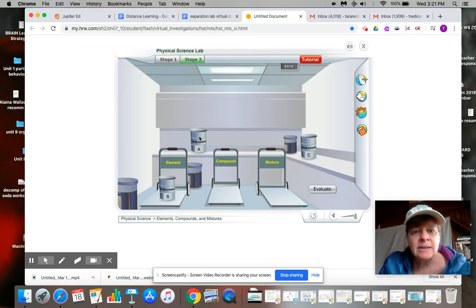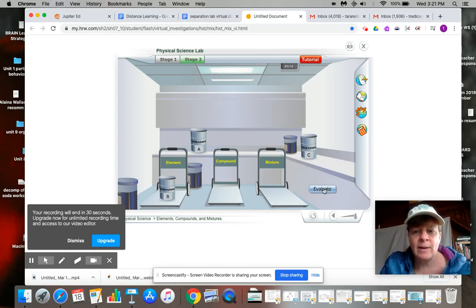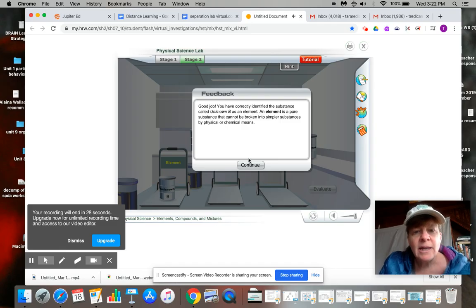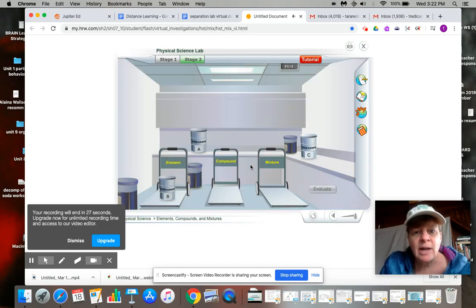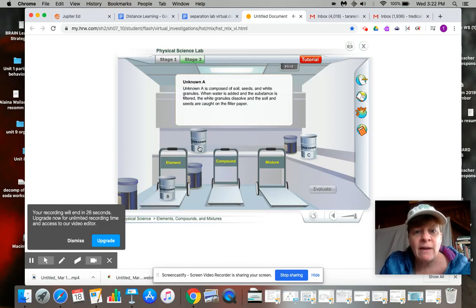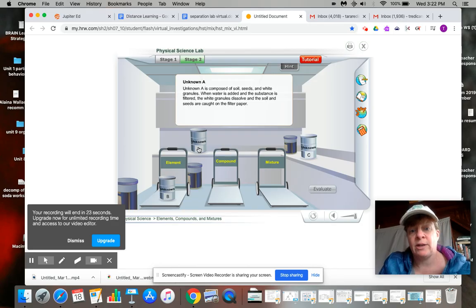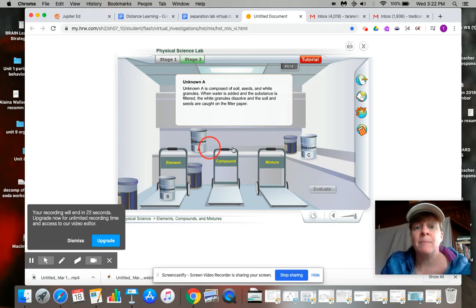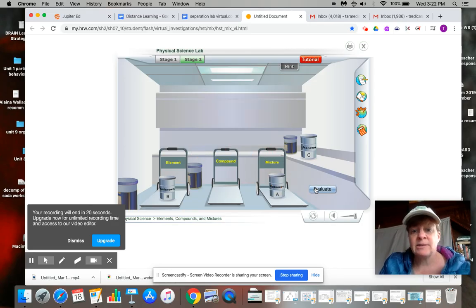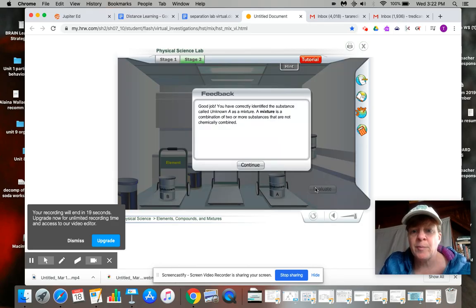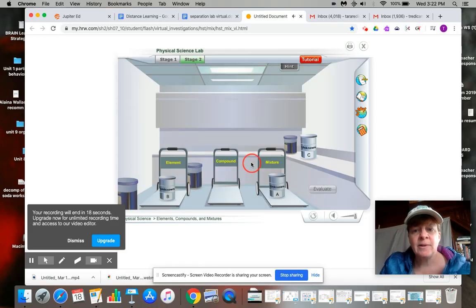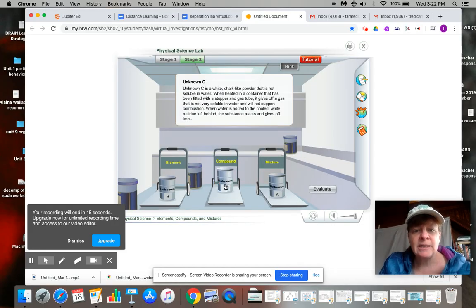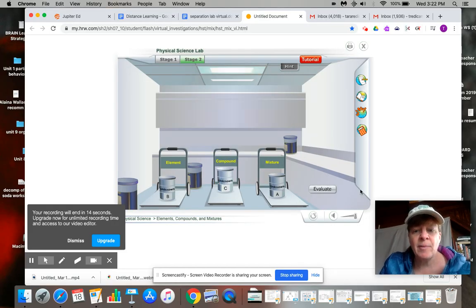Let's see what A is. Come on, A. Oh, evaluate. Okay, good job. So we have that one. It's composed of soil, seeds, and white granules. That is a mixture. It's a mixture of different components. And just like I thought, unknown C sounds like a compound.